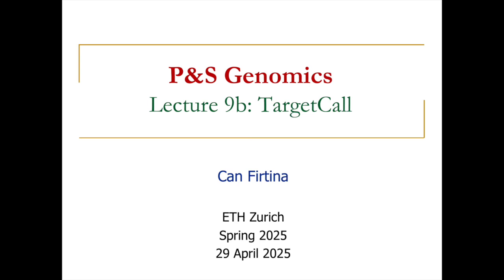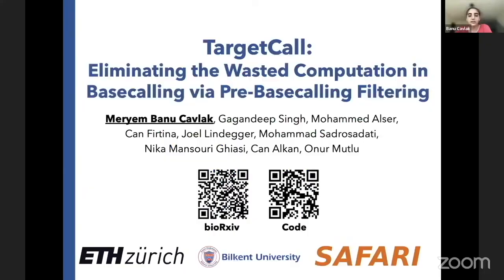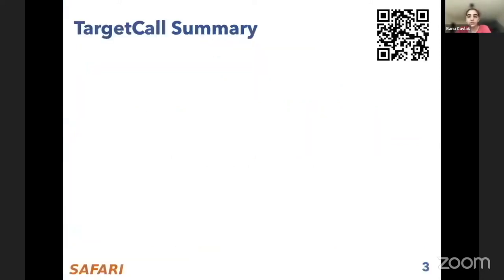Hi, I'm Banu and I will present TargetCall, which is analyzing these nanopore signals in a different way. The title of our work is Eliminating the Wasted Computation in Base Calling via Pre-Base Calling Filtering.